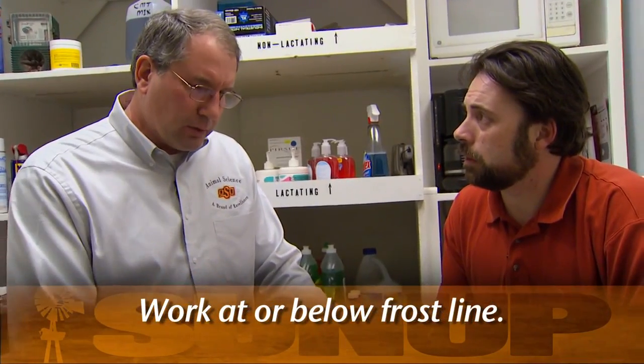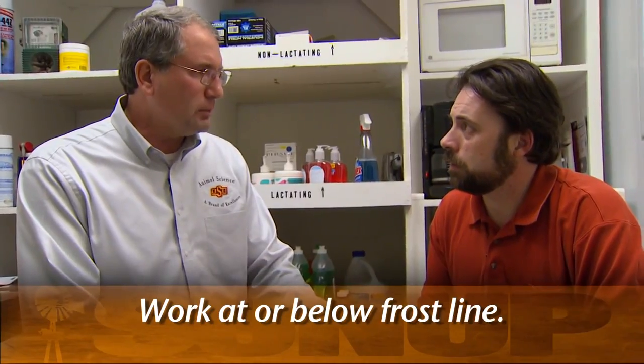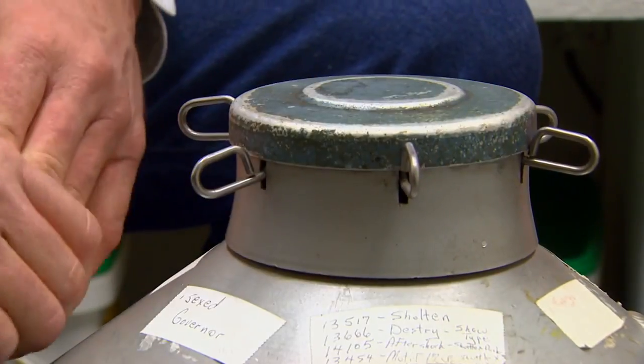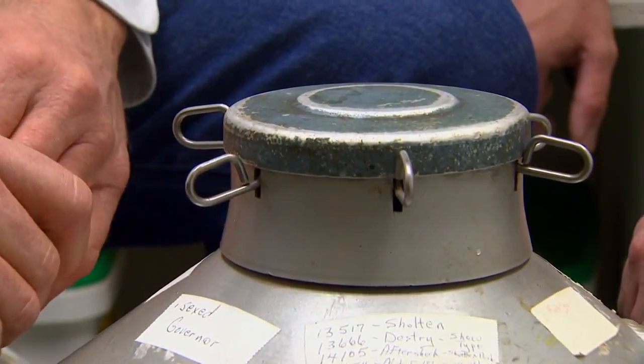Well, yes, because any damage to the semen will be permanent, and then that can be a problem as far as your conception. Any refreezing, thawing, refreezing, and so on, you've got trouble. No, if it's thawed out, you don't want to go back in the tank again. It's just going to be detrimental to the semen. There is a freezing process that it has to go through, and just to pull a straw out, thaw it out, and say, well, I don't need it, put it back in, no, it's not going to work.